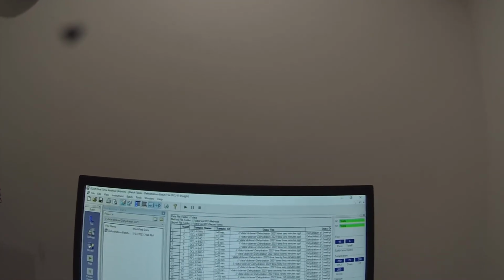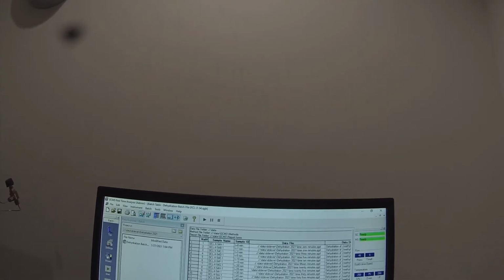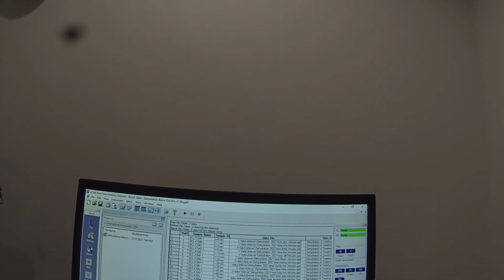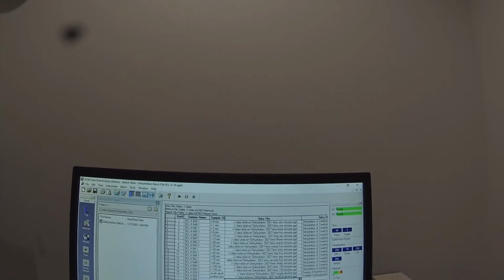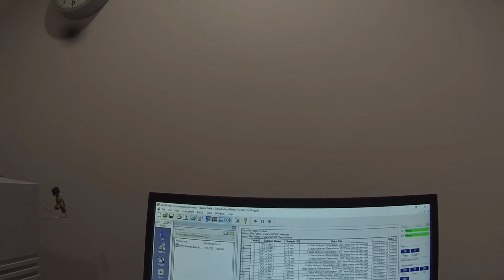And I'm going to save this batch file so I don't have to redo the whole thing. So these are all pointing at the JData DC Lever folder into dehydration 2021. 0, 1, 3, 5, 10, 15, 20, 25, 30, 45, 60, 75, 90, 105, 120, crude alcohol, purified alcohol. So I have the whole batch file set up.